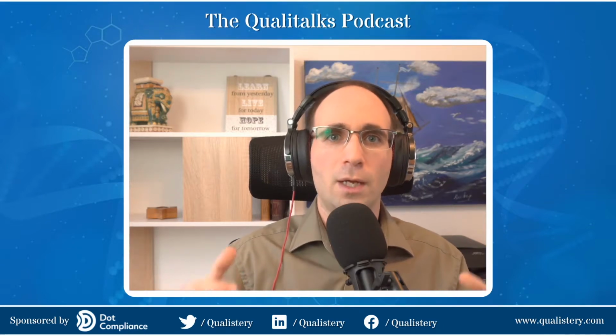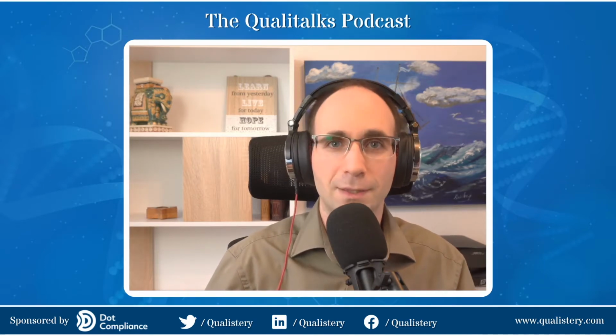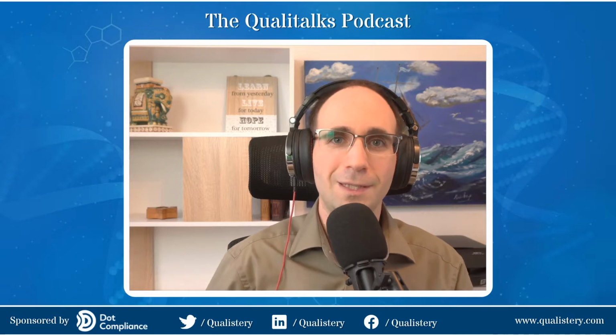So we're going to talk with Chris about how to choose the right equipment for you, how to plan the validation phase correctly, and how to think about the correct user requirement specification and test everything so you don't have any issues down the road, because it's much more difficult to fix it afterwards. So let's get to it.